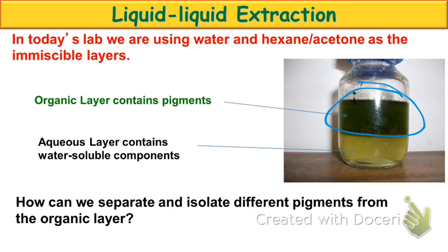That new technique applies the same technology, if you will, as TLC, the same general principles, except all we do is turn it on its head. So we just flip it over. So we'll take our TLC plate. Okay, you notice those were kind of flexible. What we'll do in theory is turn it into a cylinder. So wrap it up so it's a nice little cone. Or not a cone, but a cylinder.